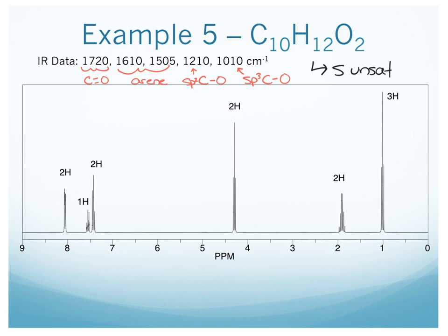So when you see these 3 things together, what that often indicates is an ester.